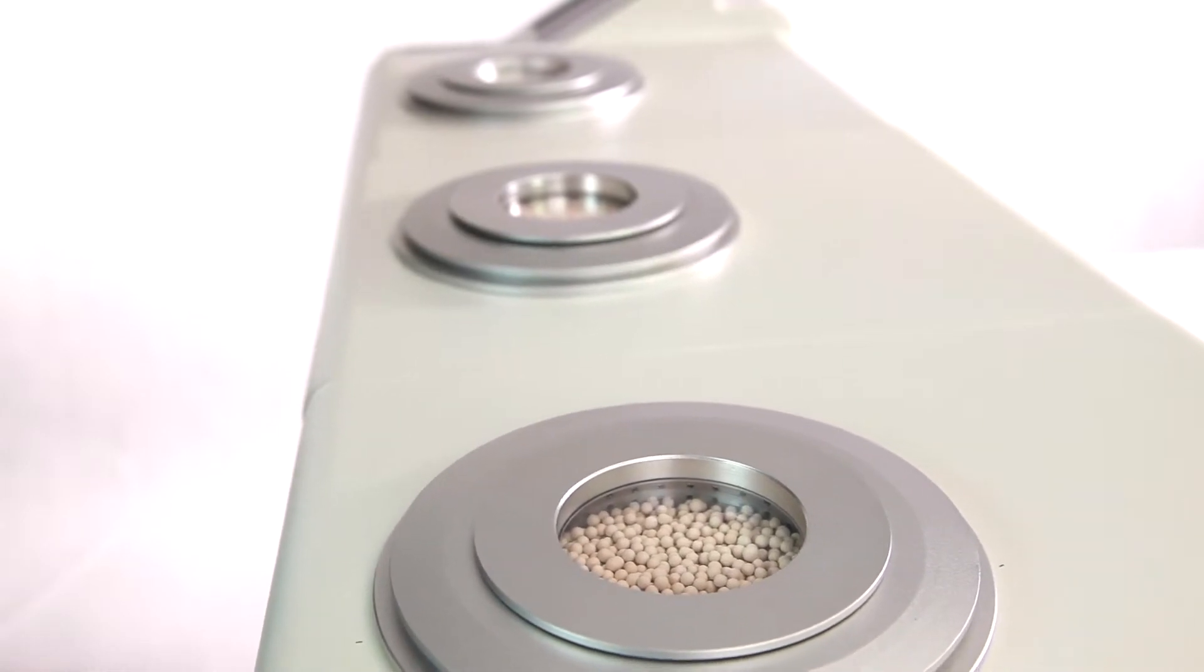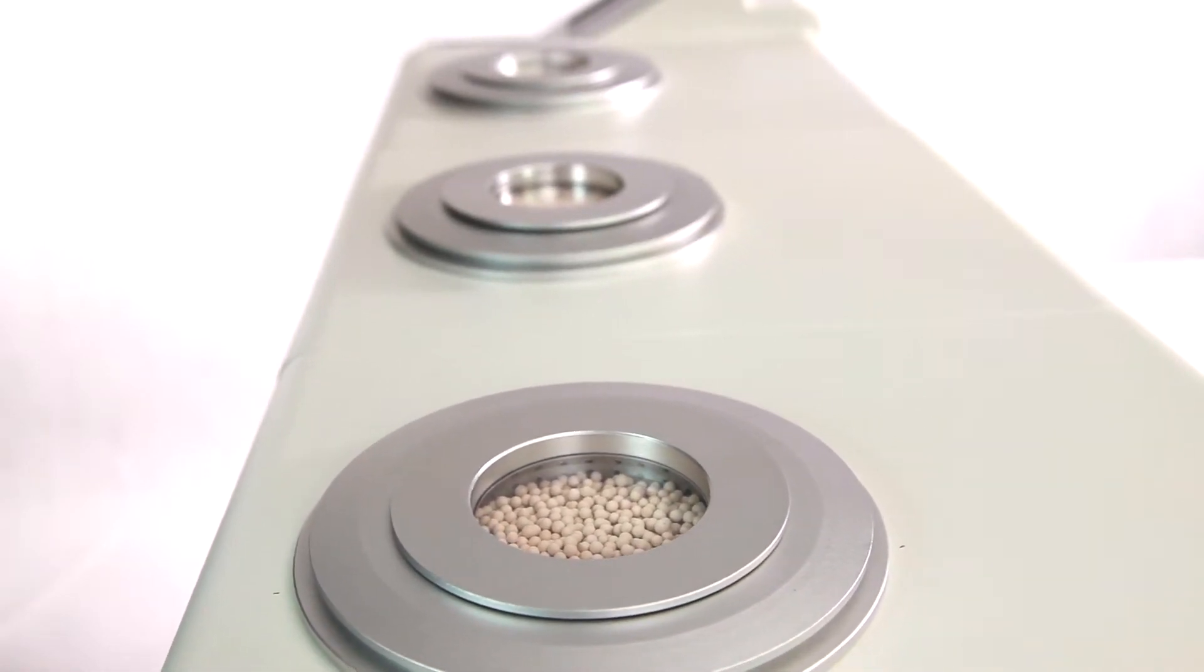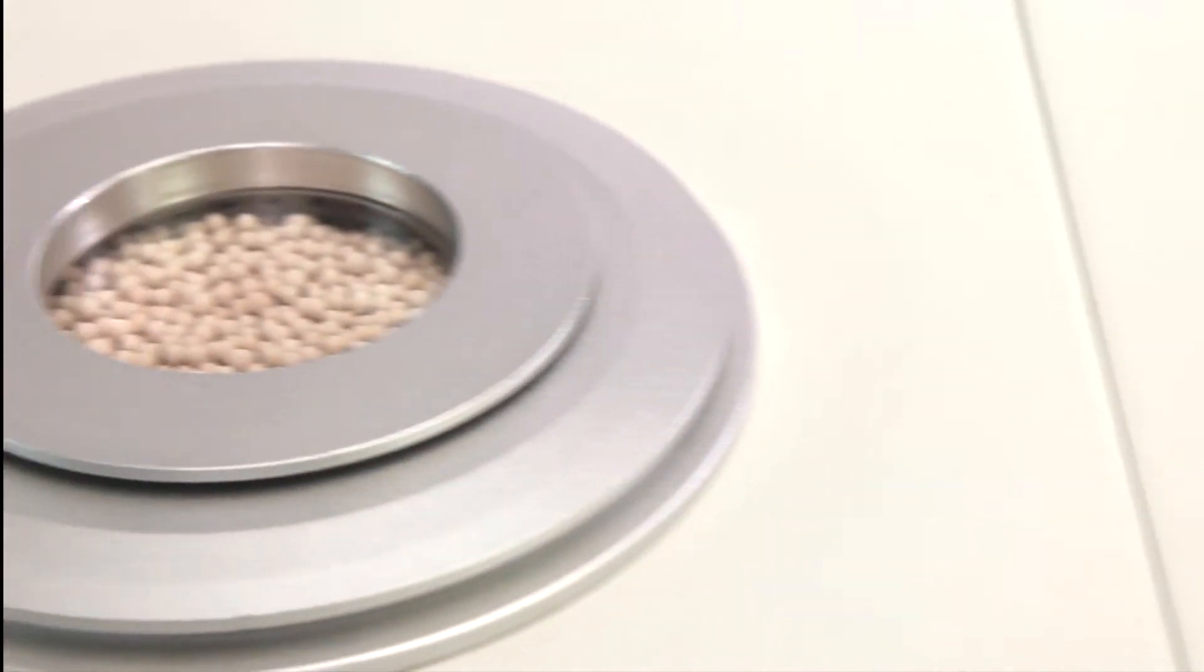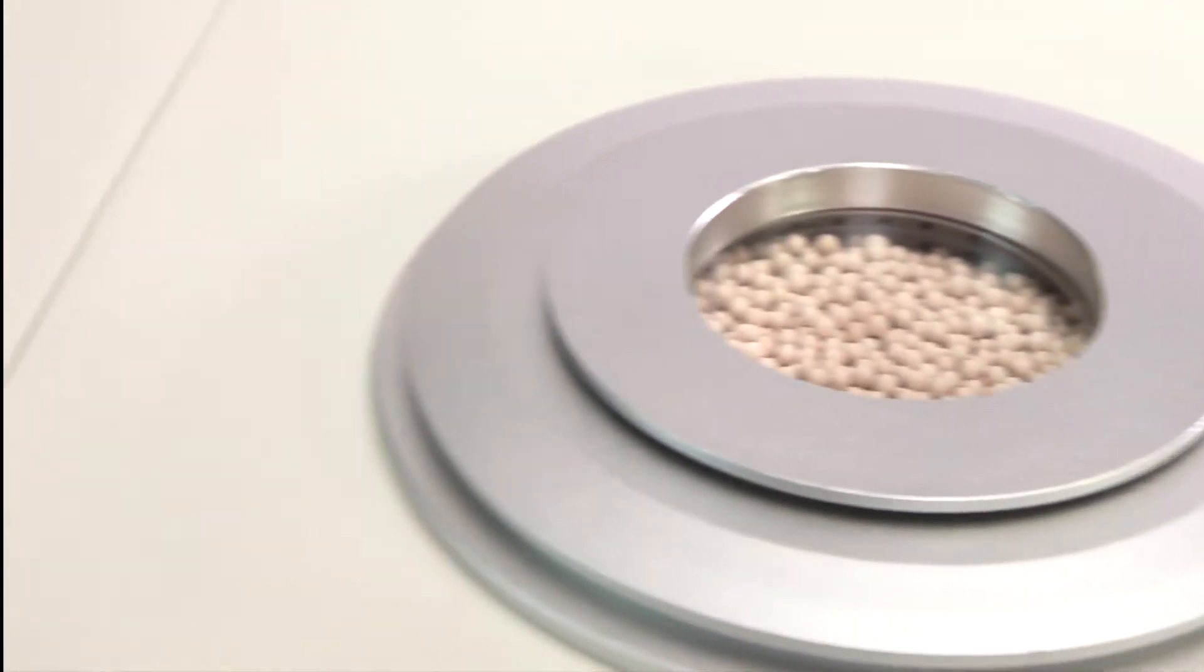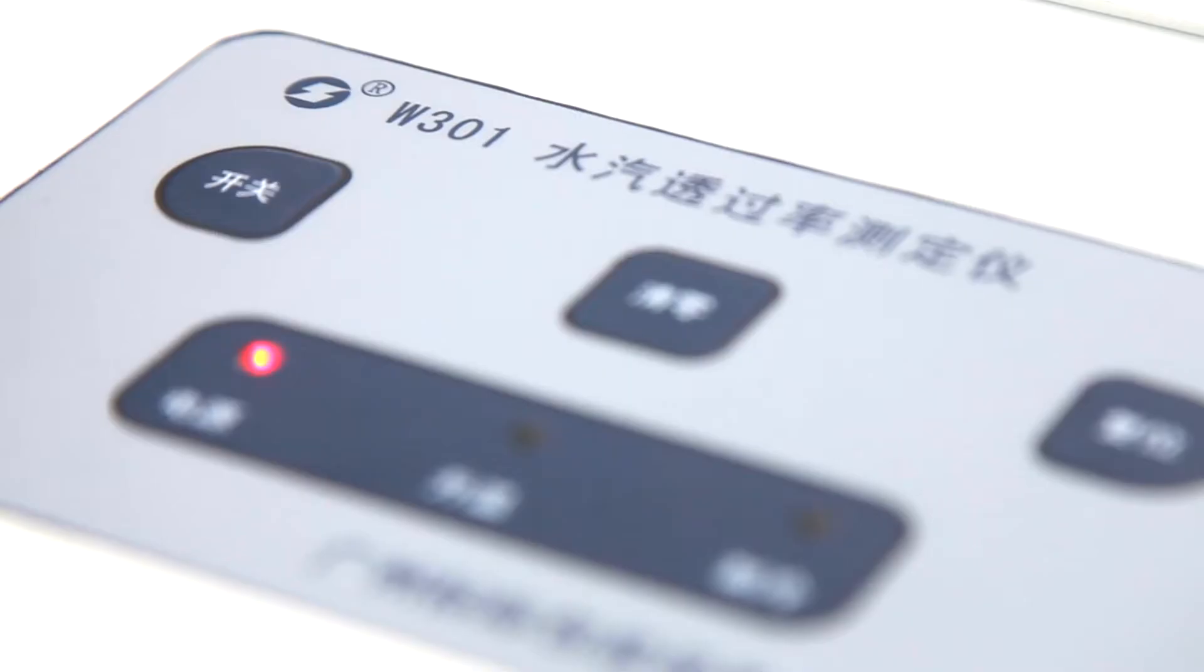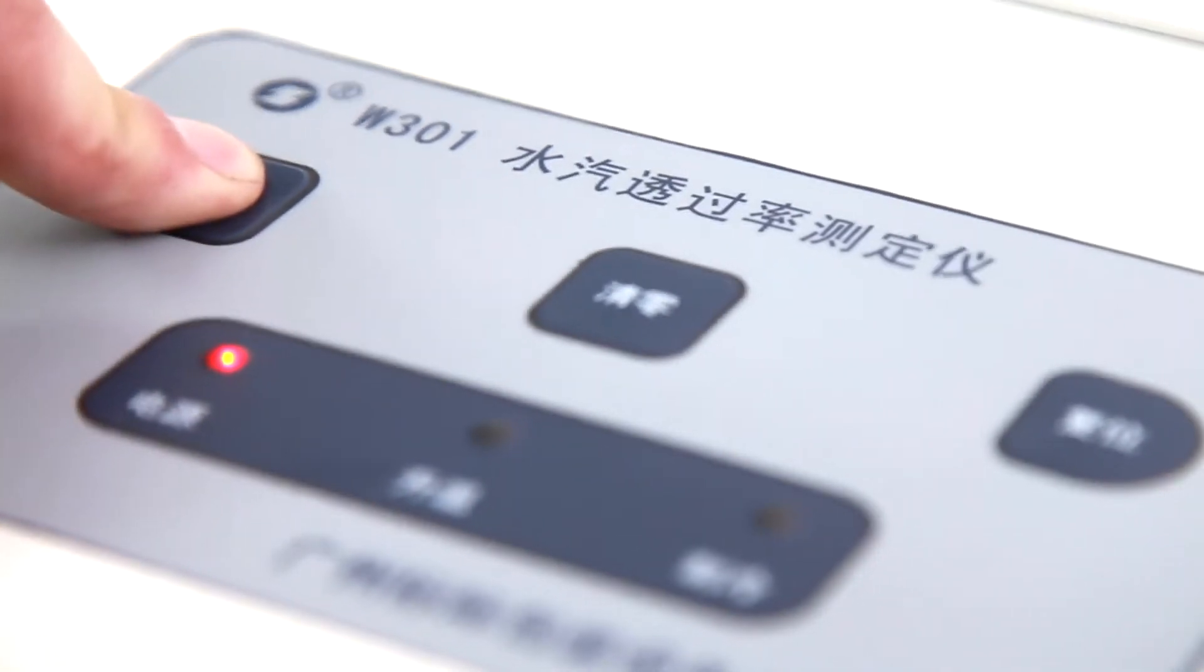W303 has three tester chambers. Each tests independently. Each chamber has independent sensor. It can run only one or two chambers. Each chamber has independent temperature setting.